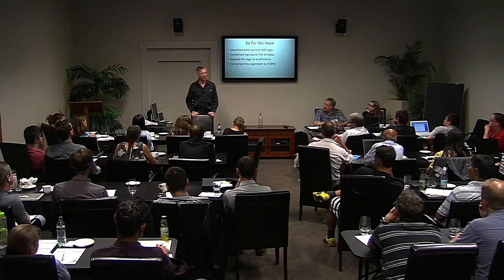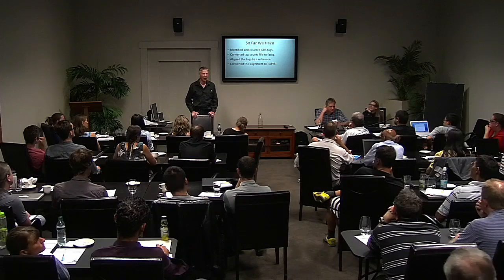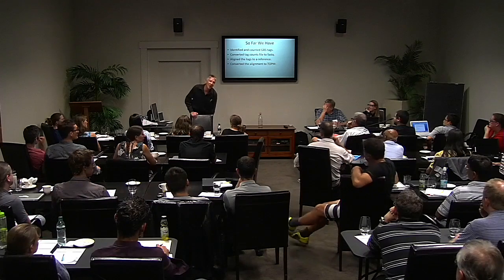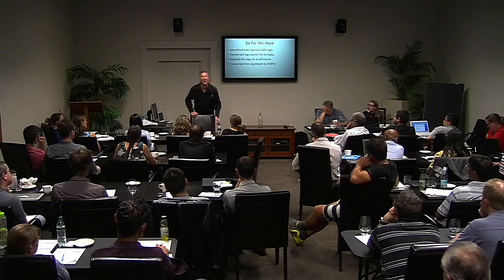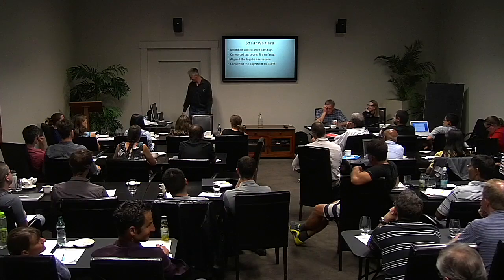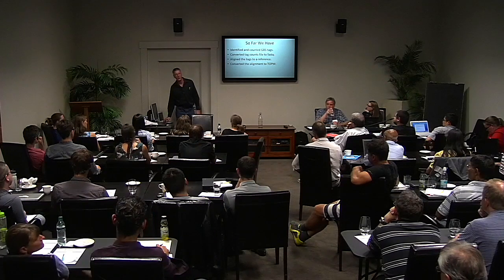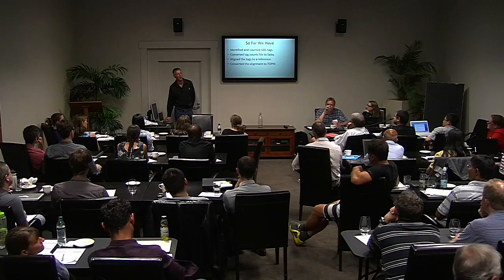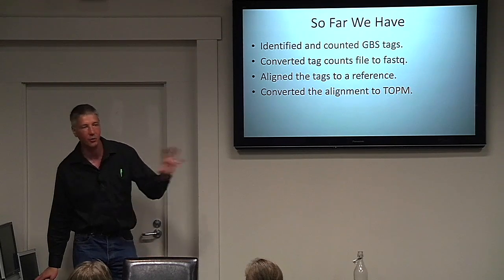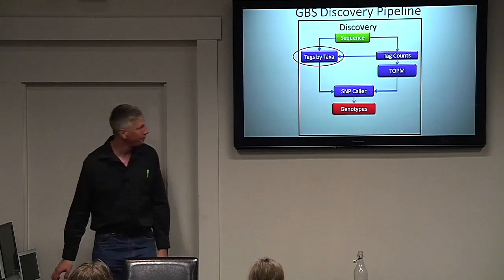So it's whatever the aligner tolerates. Yeah, and then you have to define that for your species. It's another dial, right? And it's useful to do some testing. This is why I spoke earlier today about testing things, and having external data sets that you can work with.